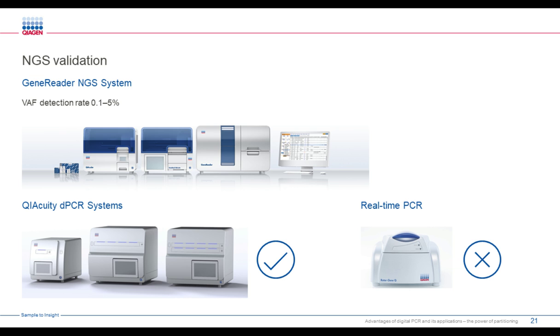It depends on how deep you do your sequencing. But when you are down to 1% or 0.1%, a normal qPCR is not good enough to validate what you get. If you are within 1 to 5%, you can use a real-time PCR. That's not a problem because it can detect down to 1%.